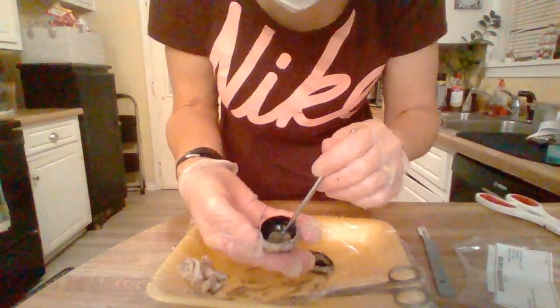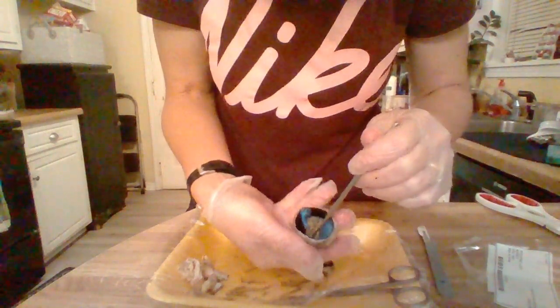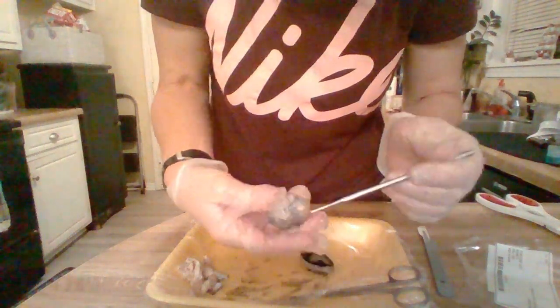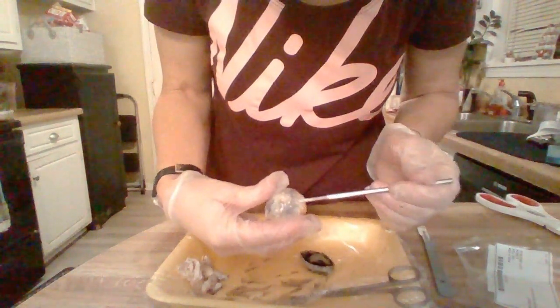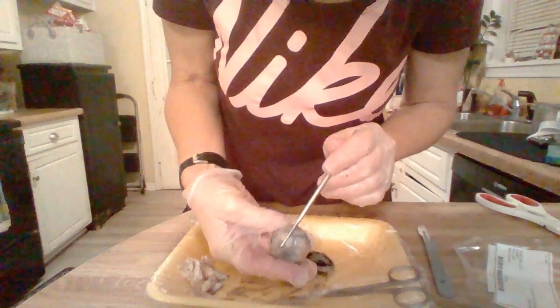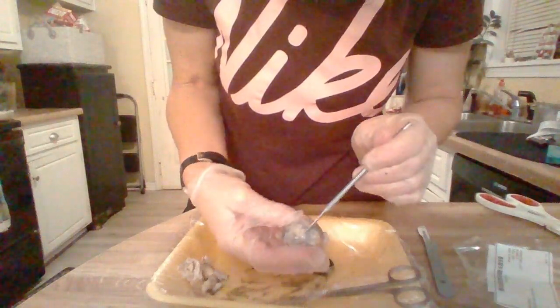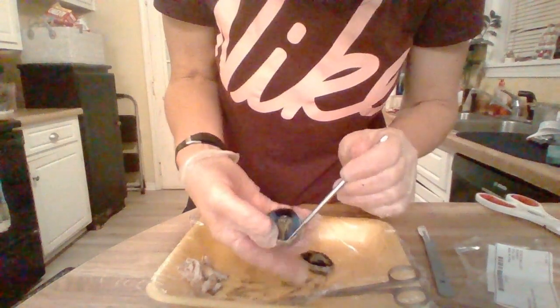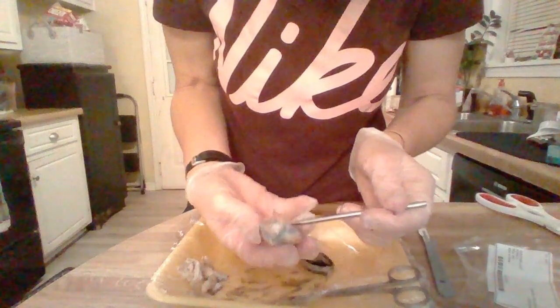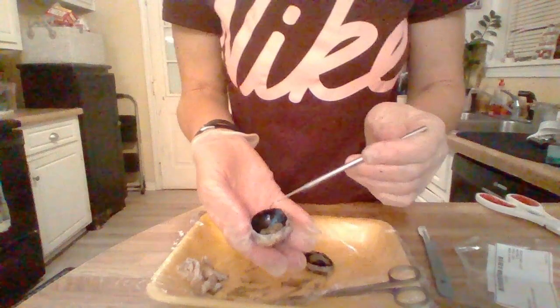The retina isn't falling out all the way because it's attached to the optic nerve back here. Here's our optic nerve right here. That's where the retina is attached, which is why it's not sliding out all the way. And then this black part right here is the choroid.